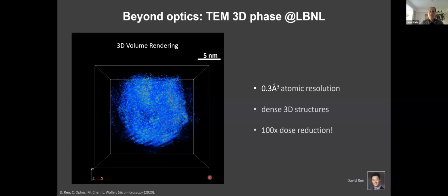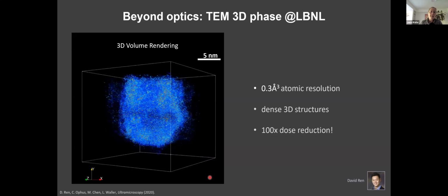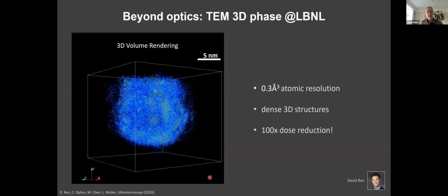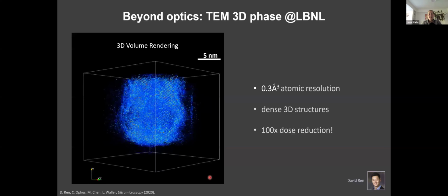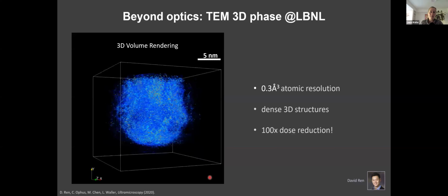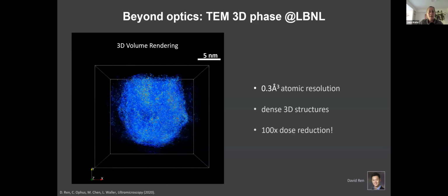But our collaborator on this material science stuff says the biology stuff is really interesting, but they don't really have multiple scattering. I think the idea is that biological samples are relatively weakly scattering, so there would be less scattering in cryo-EM. But this result is exactly the same method. It's just putting in electron tomography data rather than optical data. So it's interesting, and I'd love to talk more if somebody wants to try something.